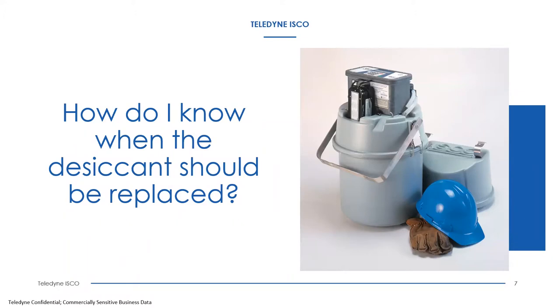On the topic of desiccant: there is a round disc on the front of our samplers marked with 20, 30, and 40, representing the percent of relative humidity inside the sampler case. On a new sampler, it should be a bright blue color — less than 20% humidity. As the unit gets older and there is some air exchange from the outside, the humidity indicator will start turning a lighter blue, then white.